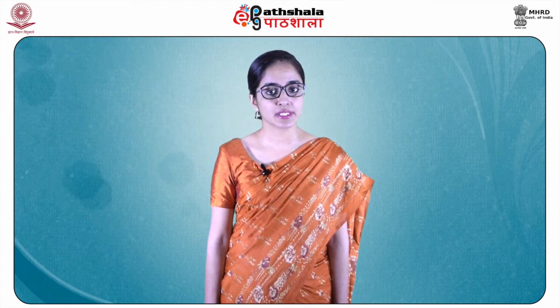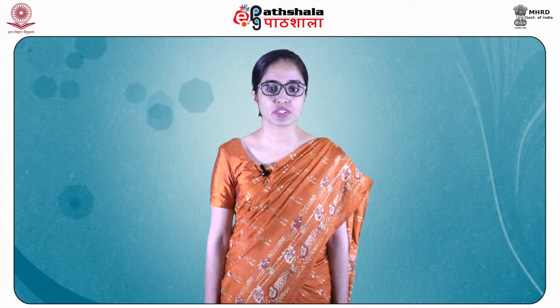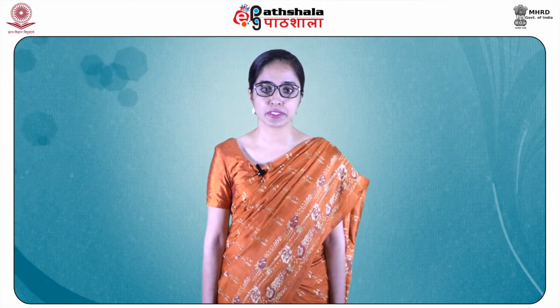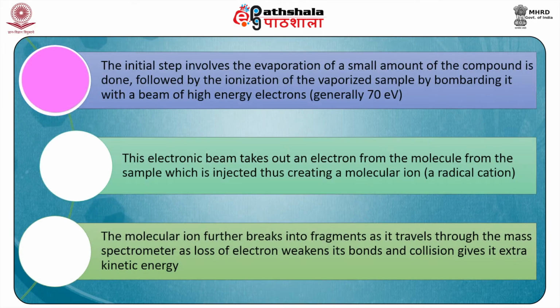So, you can understand how mass spectrometry is so useful for organic chemists who study mixtures of compounds and need to obtain a pure compound from them. The instrument should be capable of obtaining at least one scan per second in the range of 10 to 300 m/z values.